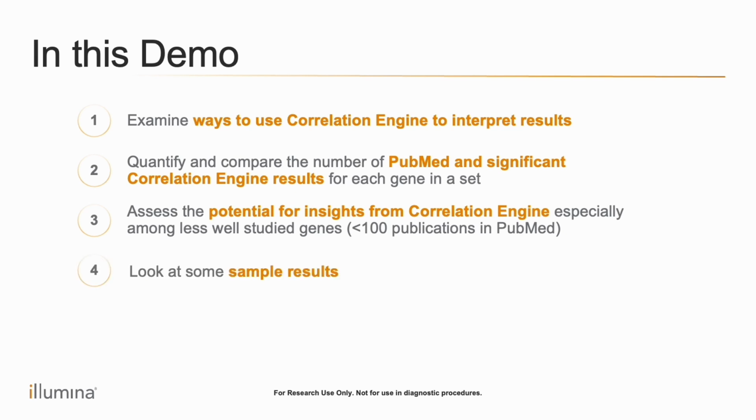Next, we'll hone in on a set of 3 genes from a specific study. And we'll end with the different ways to access gene-centered content in Correlation Engine.